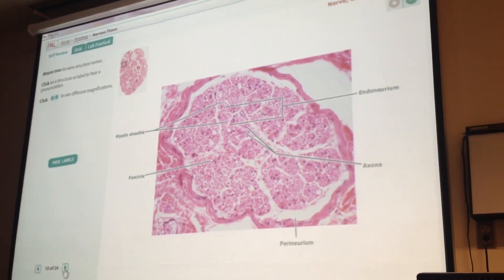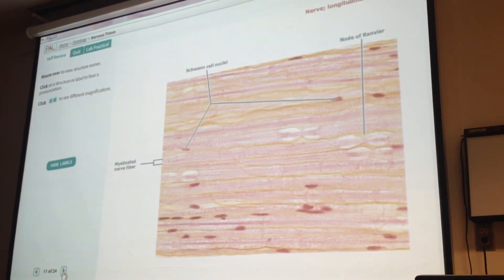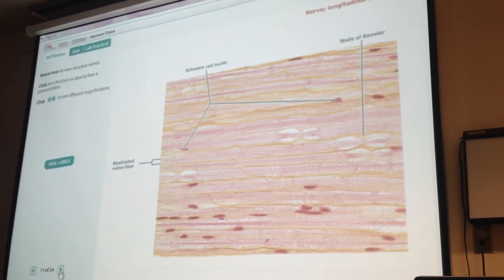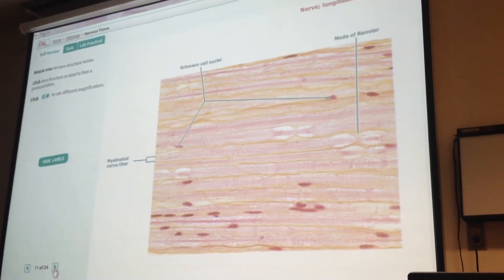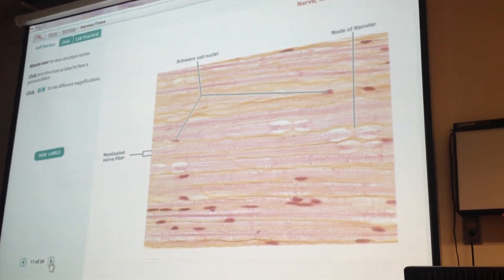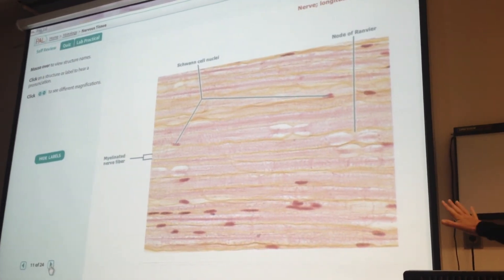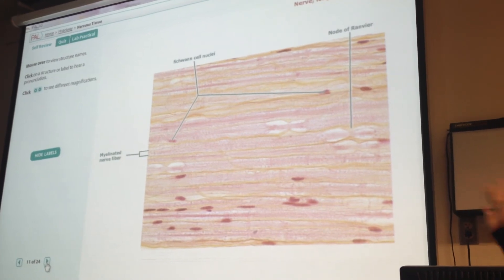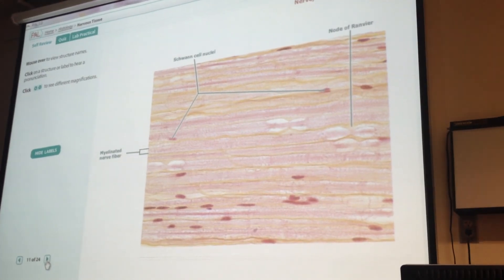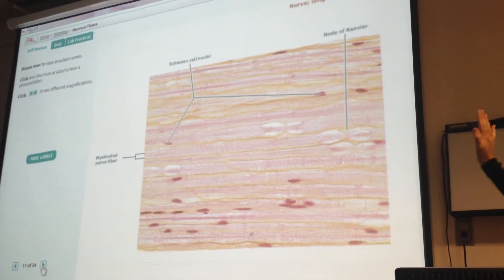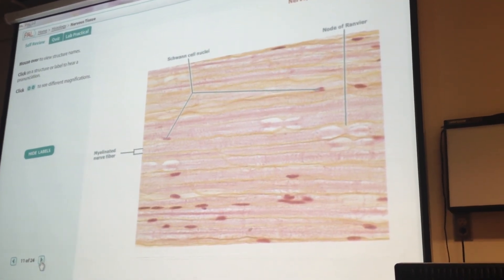And I think that does it. There's also a longitudinal section on that slide, but it doesn't come out super well on our slide, so I'm not going to test you on the longitudinal section of that one.